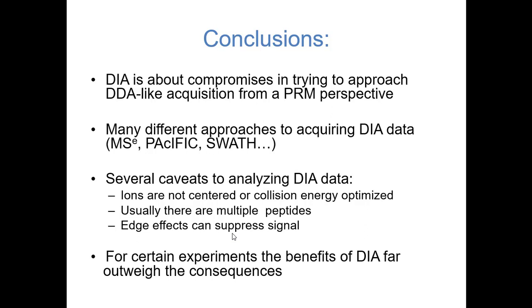Yeah. So I have some slides that show DIA versus DDA for precursor ion integration, and I can make sure that I've got that for the next section. But we've done that comparison, label-free versus label-free, and typically we get much better results with DIA than with DDA. With labeled experiments, you can get better results.